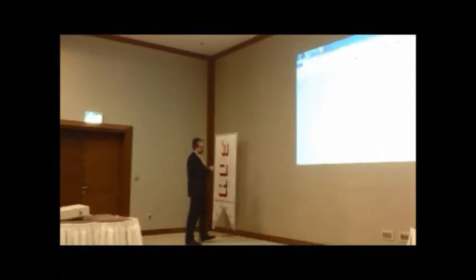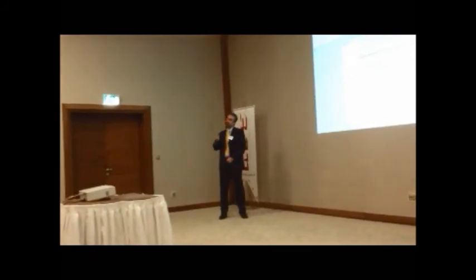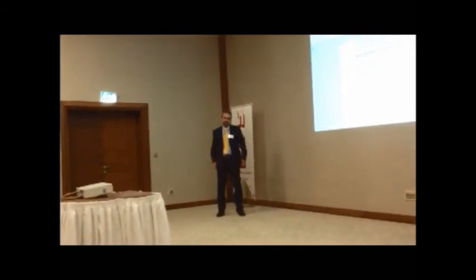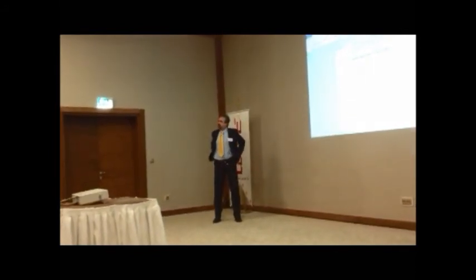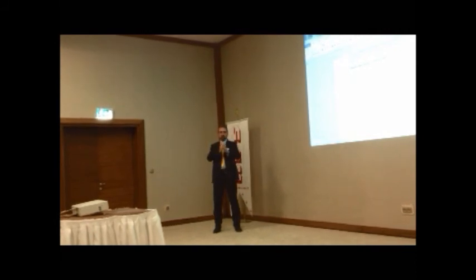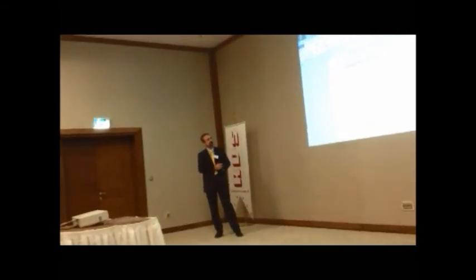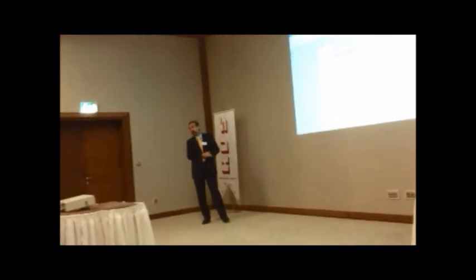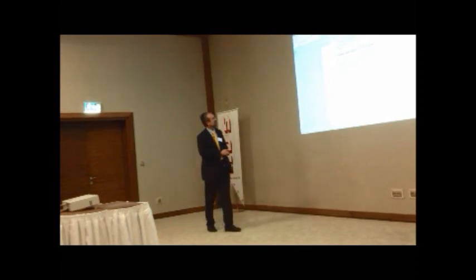We can also use your deviation procedure if it's easier for you to insert in your system of corrective action, but usually we suggest a deviation part of the protocol that we hope we don't use. Okay? We go down.